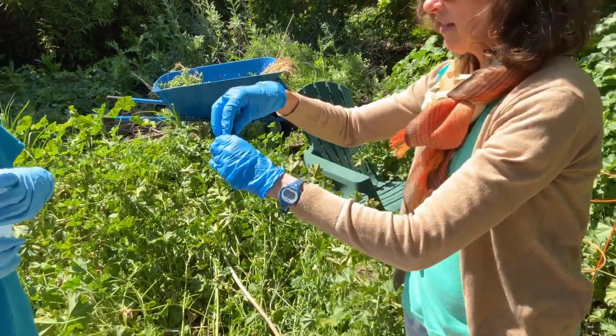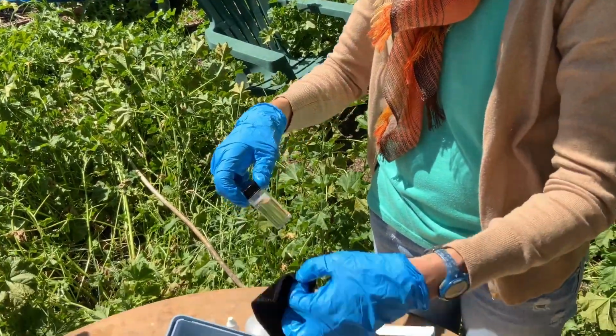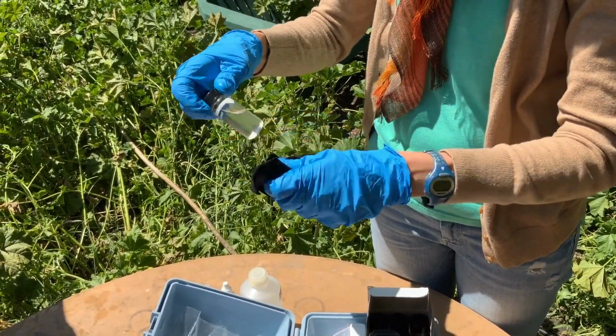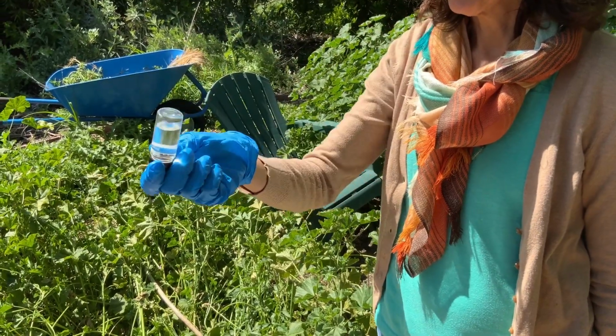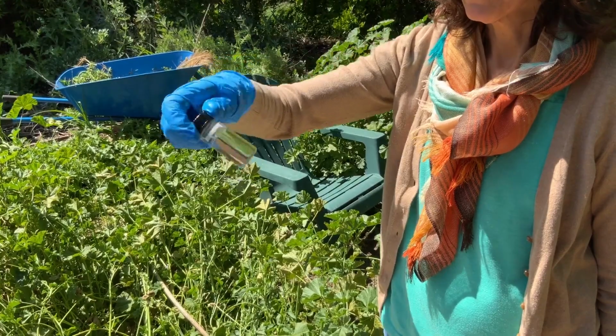All right. So I've got it, and I'm going to dry it off a little bit. And then I'm going to do the same thing. I'm going to invert it and try not to introduce too many bubbles.